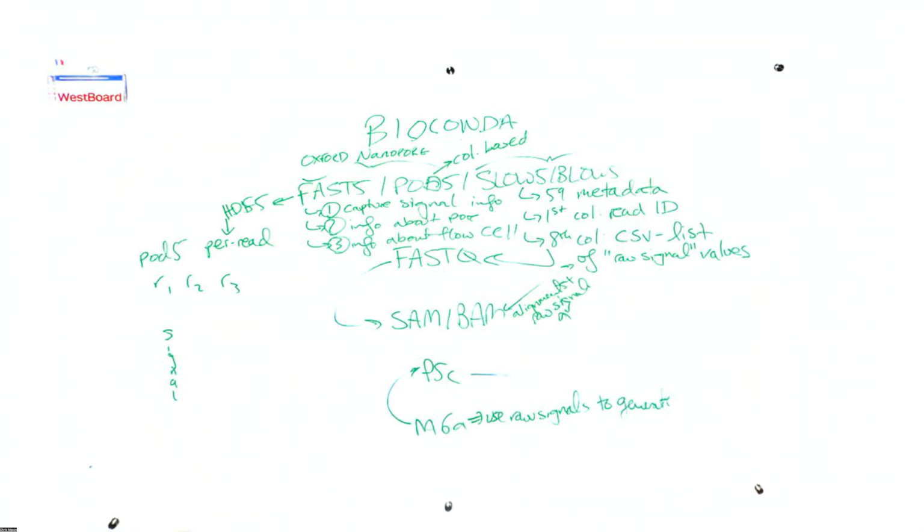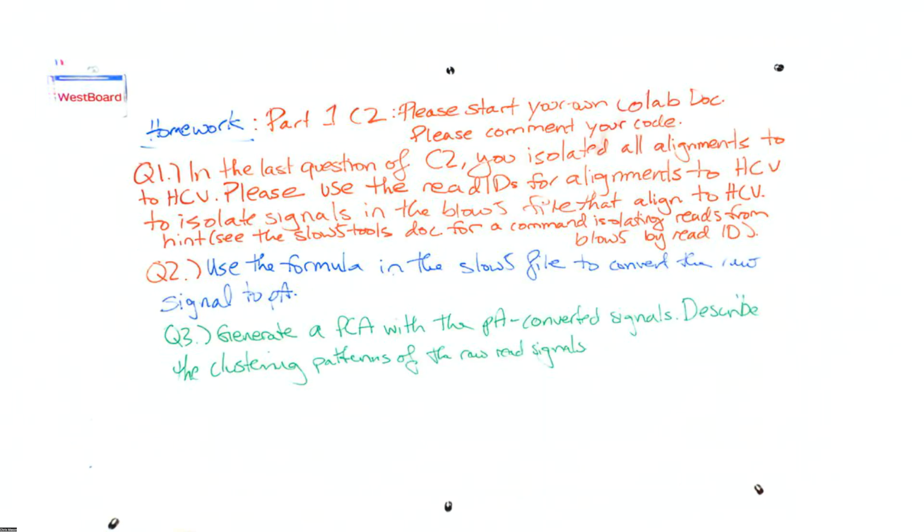Now, we're going to break out into a workshop style session where everybody takes the time to go through the notebook at their own pace. You'll see that at different points, there are questions. I tried to bold them to make it clear. At those sections, stop, look at the raw data, see what it's saying, and try to make your interpretations. If you have any trouble, I'm going to be filtering through both on Zoom and in the classroom.